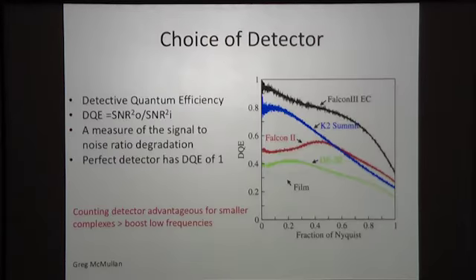Now, I'm not going to tell you which one to choose. I think you just have to try and decide for yourself which one you like. The data is there. We're getting good results with the Falcon as we are with the K2. But I'm going to talk a little bit more about them now.